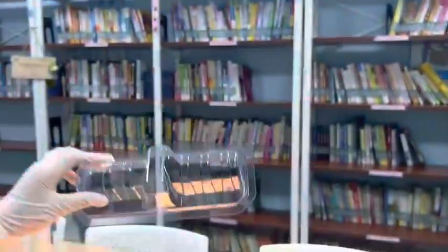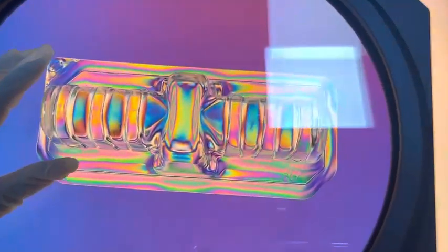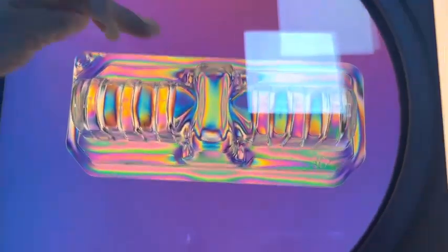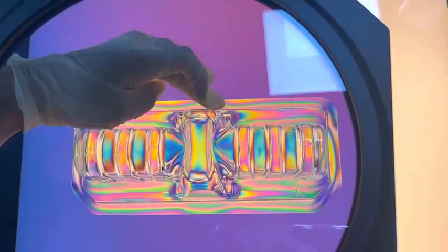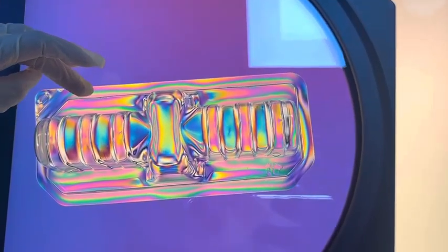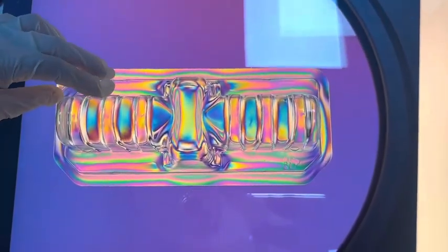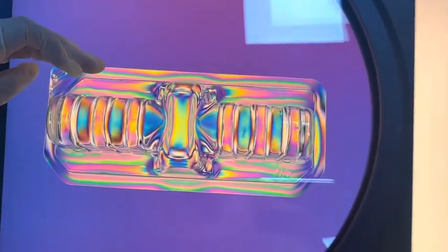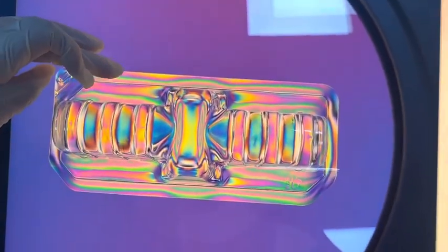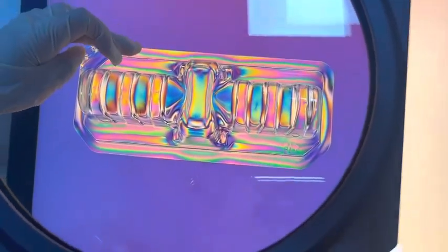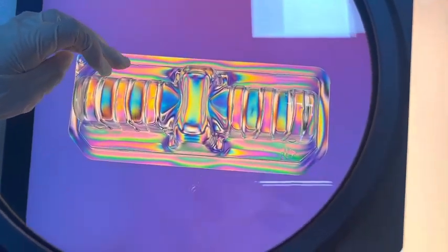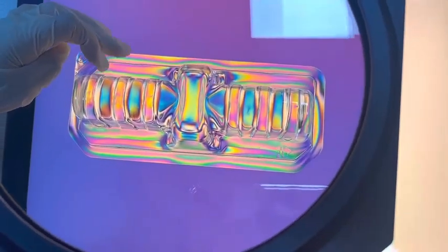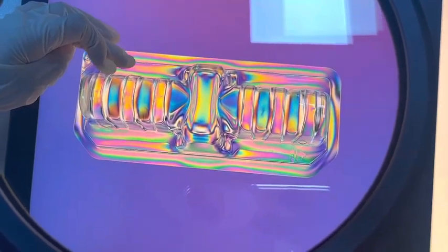Let's do another test. We can see on this side the stress patterns have different colors, which means the stress distribution in this area is uneven.